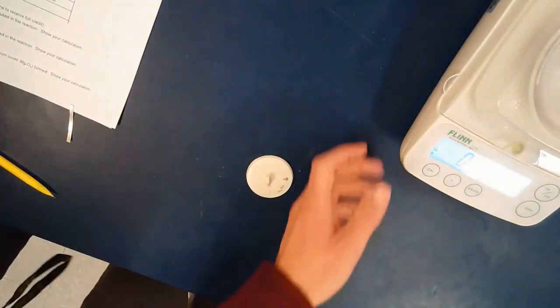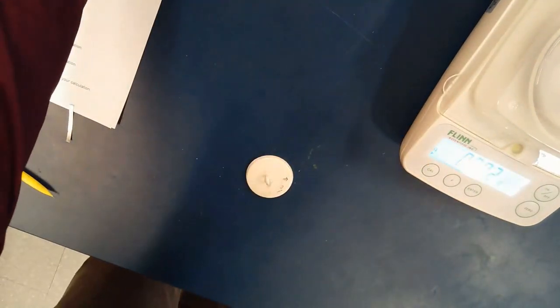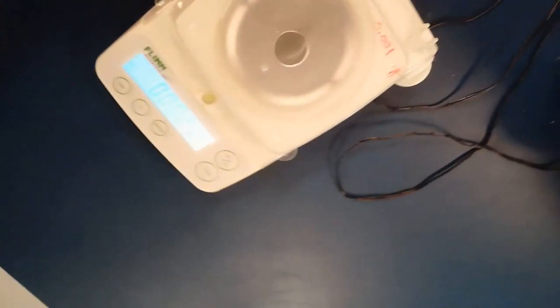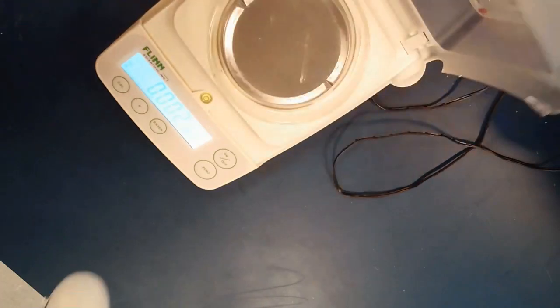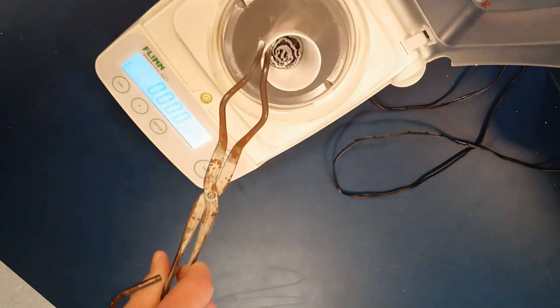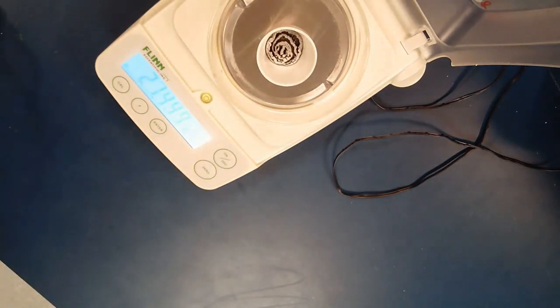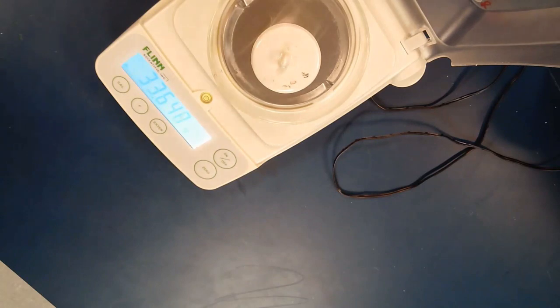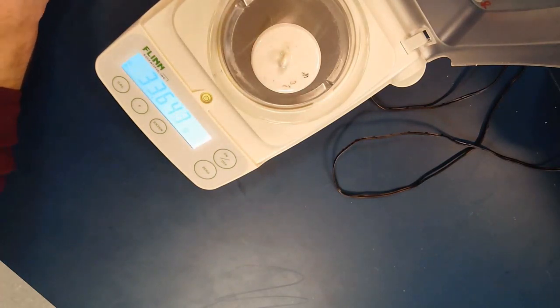Thanks, Mr. McGinnis. And then I'll bring the camera over to the scale, excuse the shaking. We'll go ahead and weigh our crucible and our lid after we clear. That's all zeroed out. So we'll put that on here. And we get a mass of what looks to be 33.647 grams. Remember, sig figs are important.